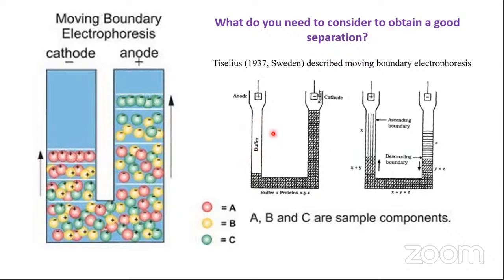That is the way in which you can judge that some degree of separation is happening. You don't move the optics. You just keep it stationary at one position. What you can do, however, is place another laser over here and a detector in order to find out whether there is a boundary formation here as well.